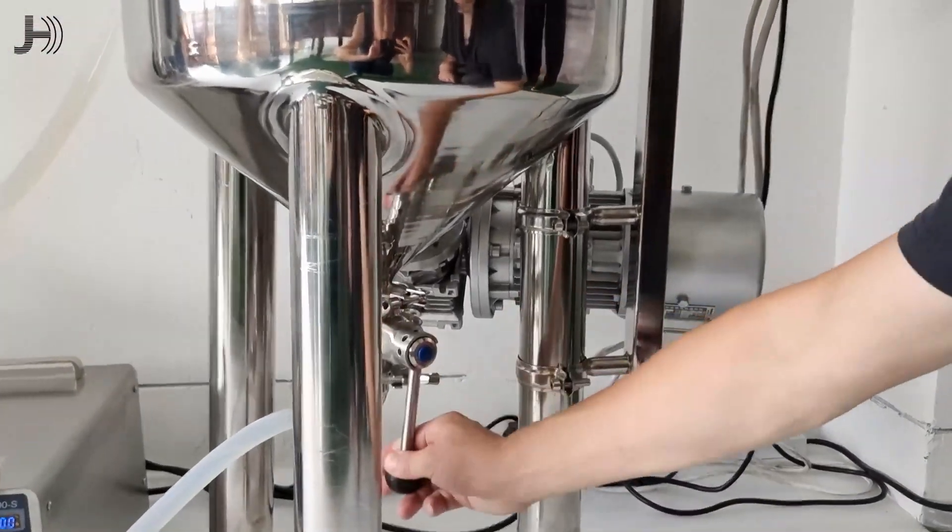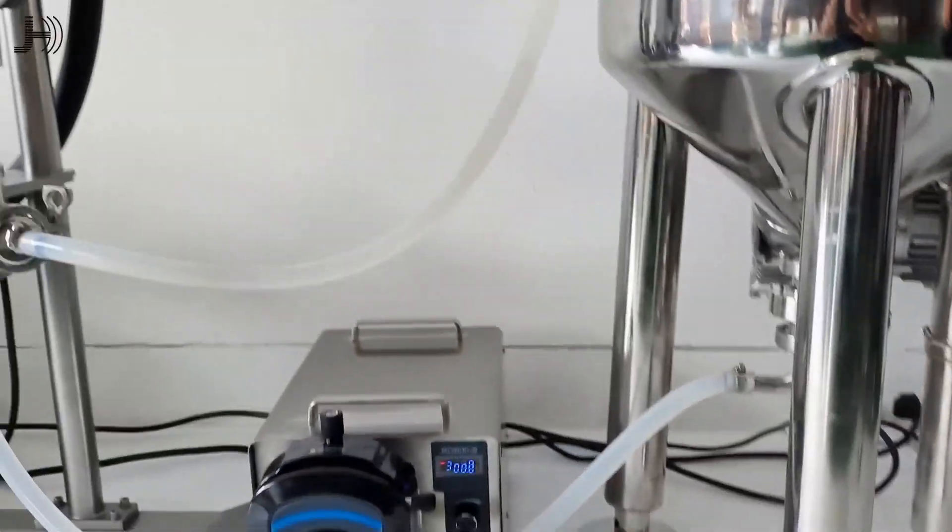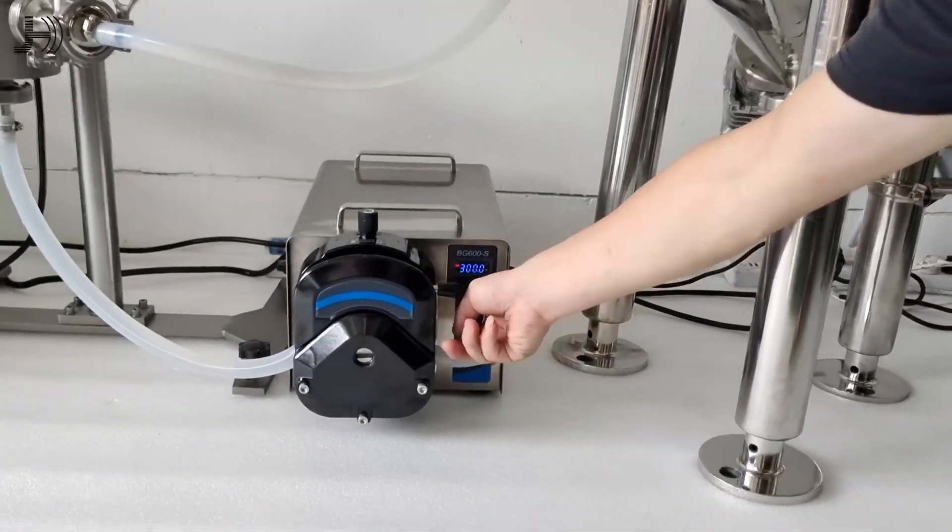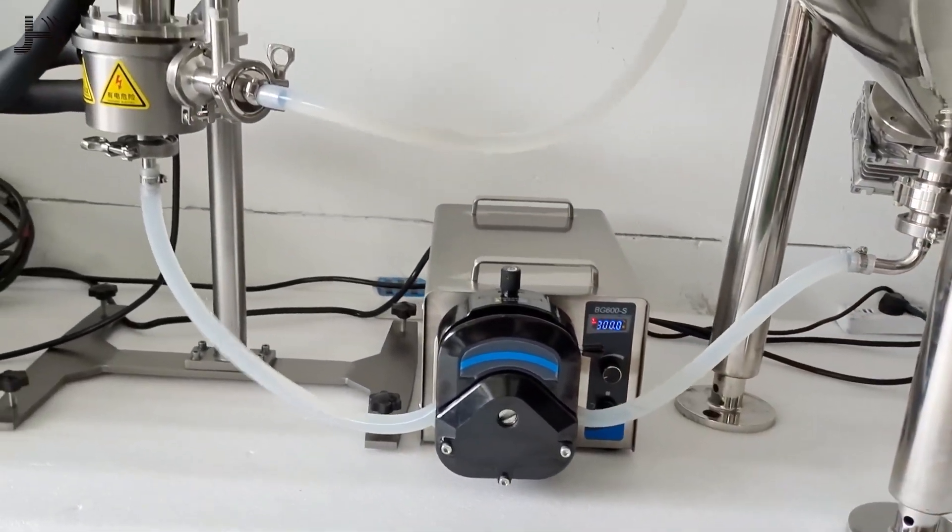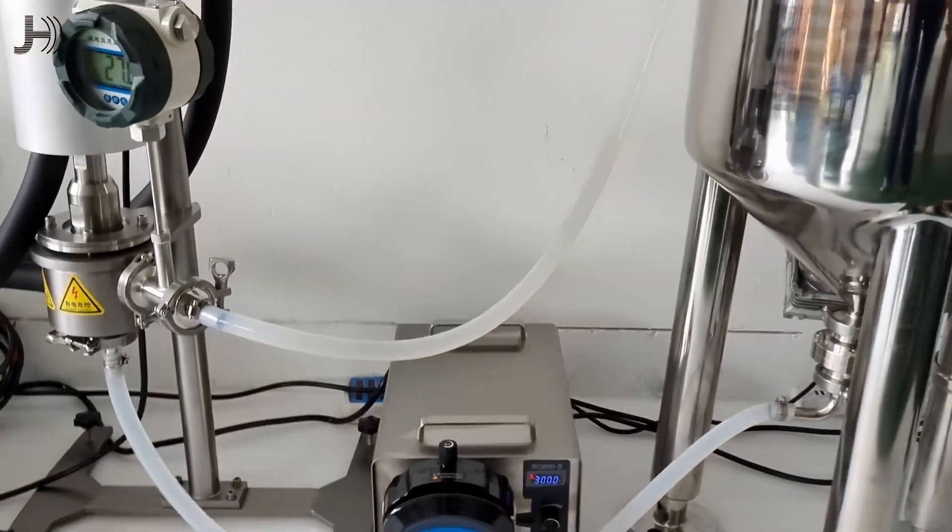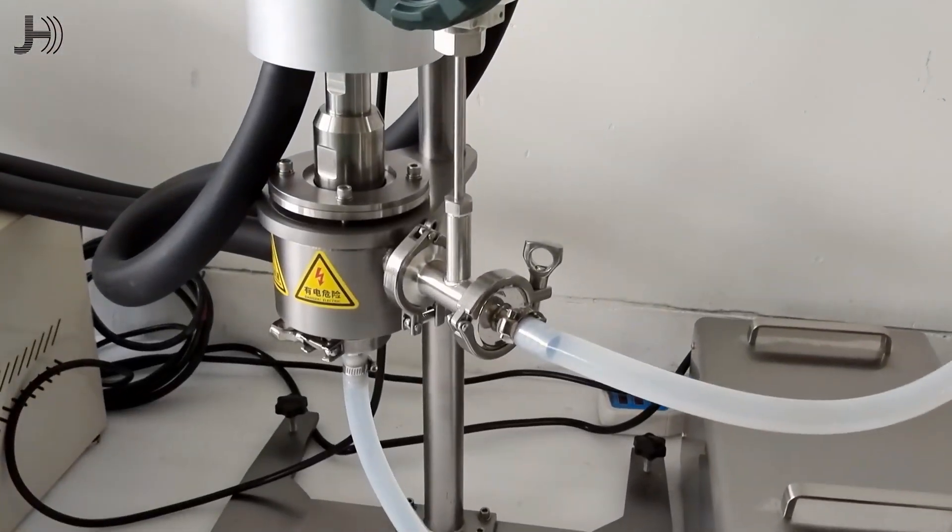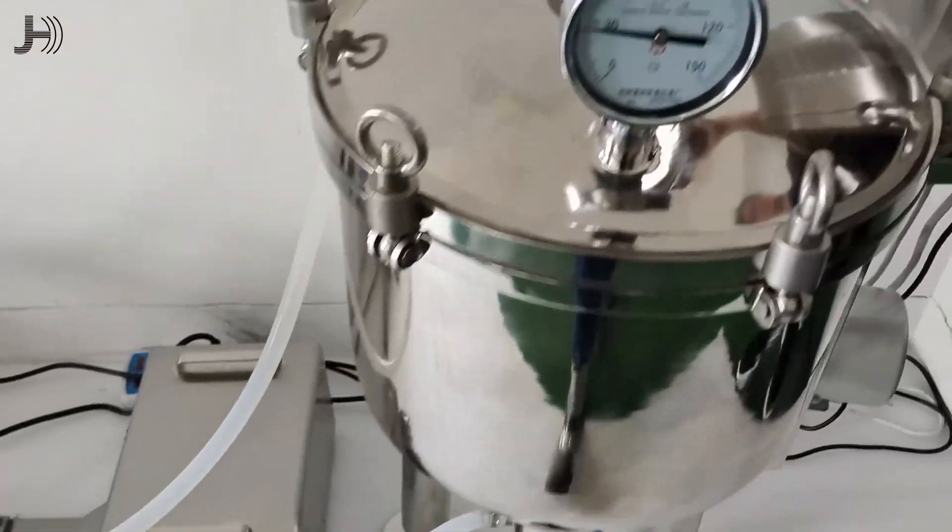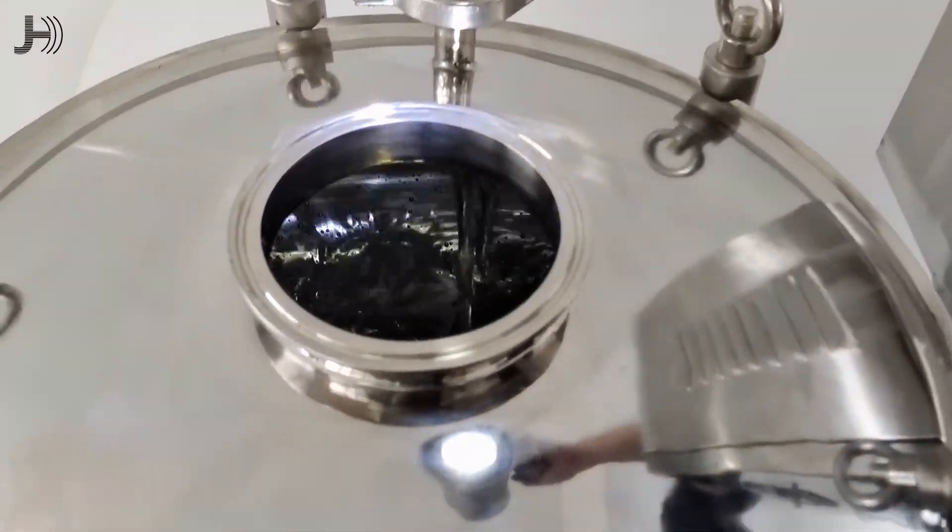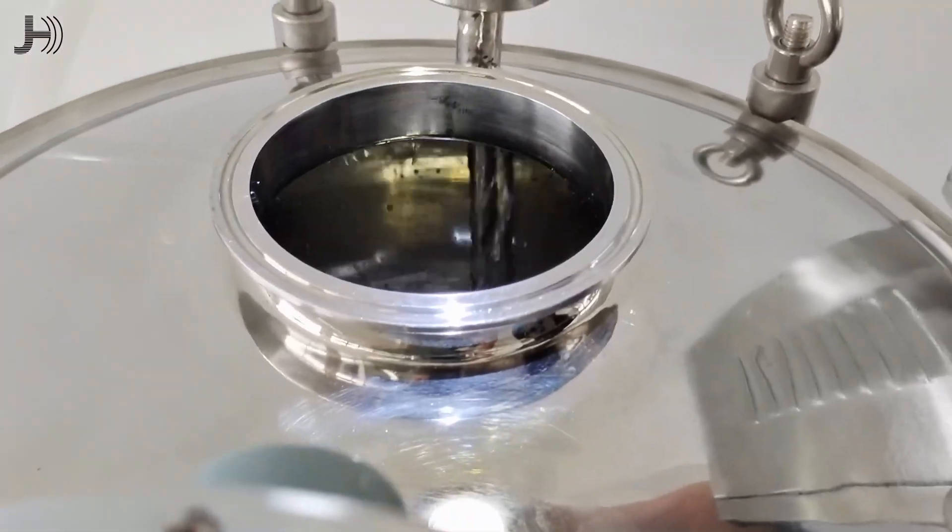Let's open the valve and open the pump. At this time, the liquid flowed between the flow cell and the mixing tank. You can see here.